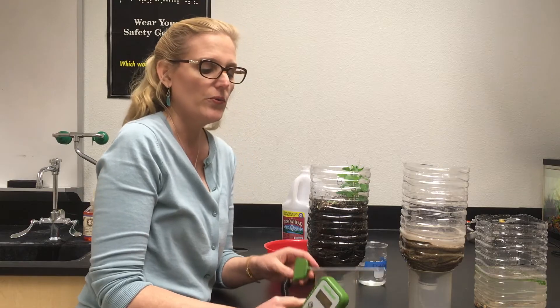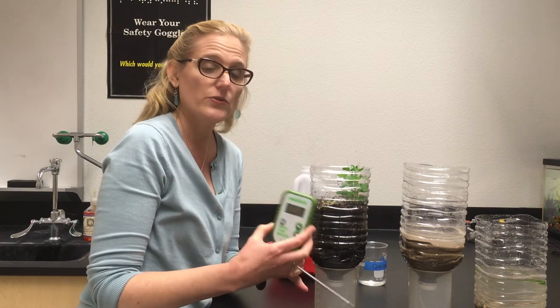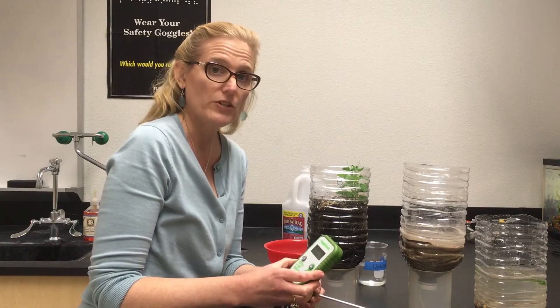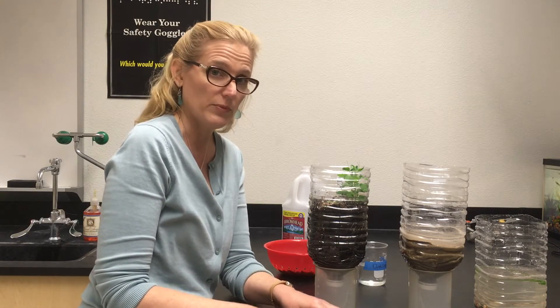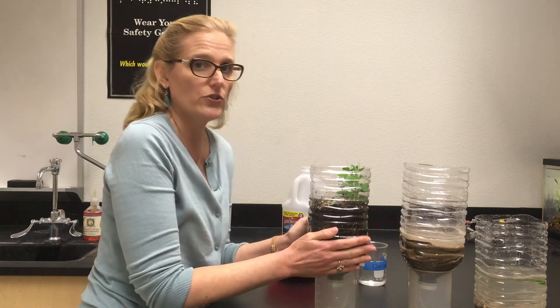Let's go over some of the ways that we can take data in our terrestrial chamber. One of the methods that we use is a soil probe. This probe measures fertility, pH, and temperature. In order to use this soil probe, the first thing you need to do is wet your soil thoroughly.